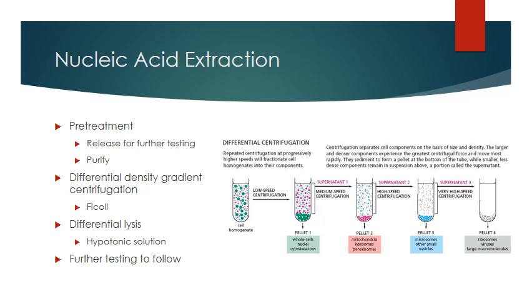Then you just have to wash off the Ficoll, right? Just wash it off a couple of times, and that'll allow you to get the white cells out. Now you've got pure white cells, so you can burst those membranes and remove and isolate the nucleic acids.